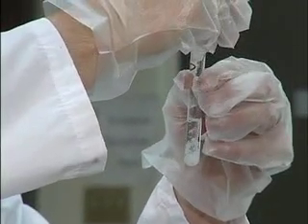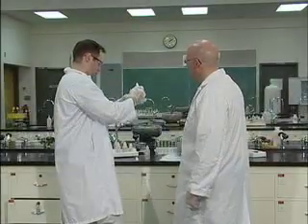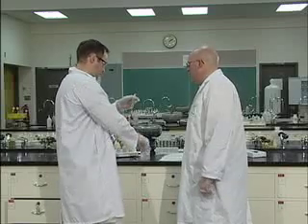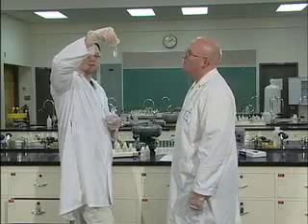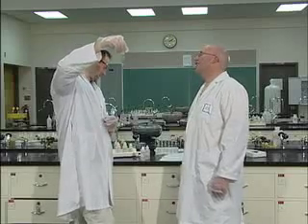Ooh, that one just comes out like a squirt. Hold on here. All my pretty white stuff's going away. You'll notice that all of your precipitate will move back into solution with a couple of quick stirs. It was looking so pretty. It was looking sort of like Christmas.